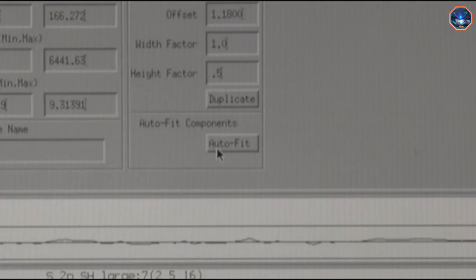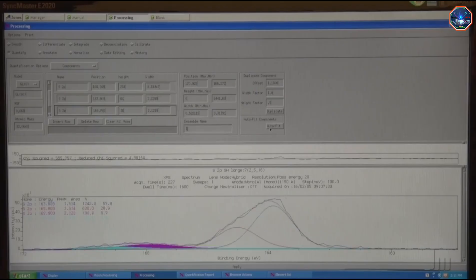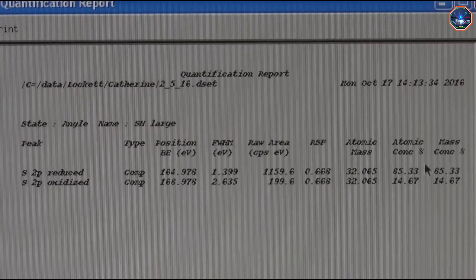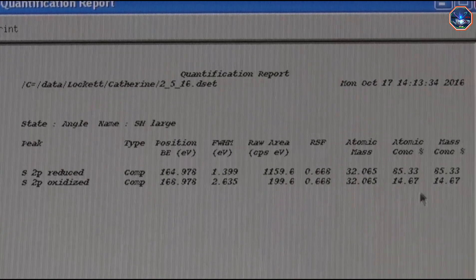Once I've added enough peaks, I can use the auto fit feature to try to obtain the best fit to the data. Finally, I can use this fitted data to determine that 14.6% of my sulfur is in the oxidized form.